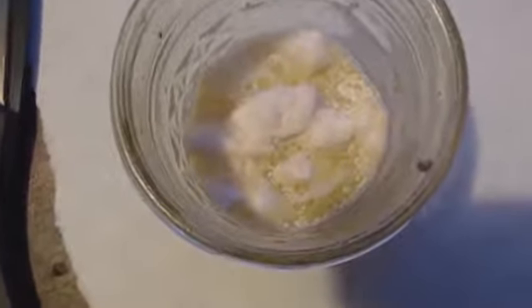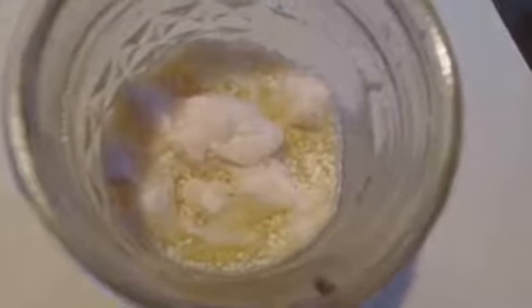Now I know these just look like globs, but that's because the water all evaporated. This has been sitting there for like a year, but before the water evaporated, and there was still water in there, you could see they were beautiful crystals separated from each other. I mean, you could literally just hit it with a little hammer, give it a little tap, and take a crystal off, and it'd be pure, or at least look pure as heck. I would definitely recrystallize it again, but the crystals looked like crystals, you know what I mean? Not globs of round. They were nice square, nice angles on them.